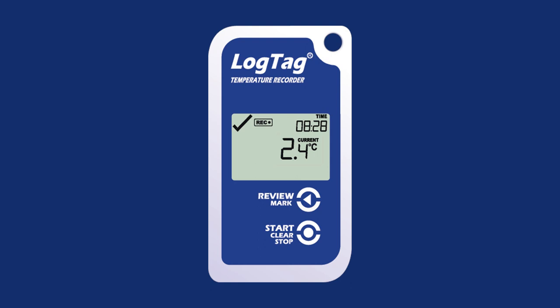Once logging has successfully begun, the temperature from the latest reading taken will display on the screen, along with a tick mark to show there has been no alarm excursions. If the temperature is over the upper alarm threshold, to the right of the screen an arrow will appear pointing up. If the temperature is below the lower alarm threshold, an arrow will appear pointing down.